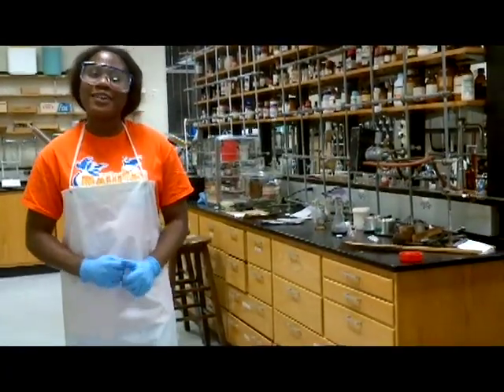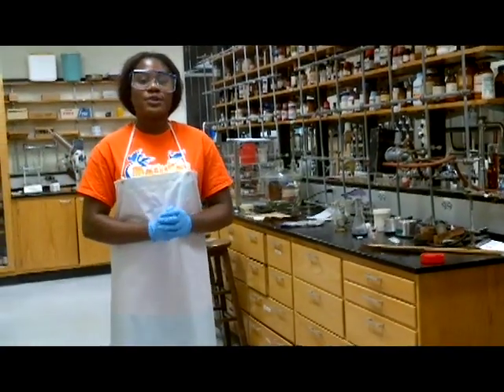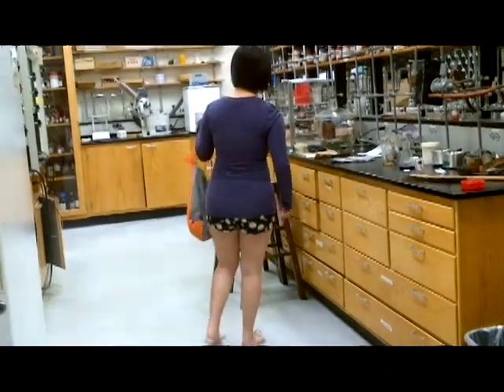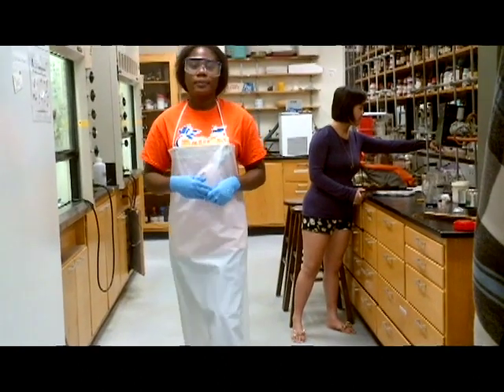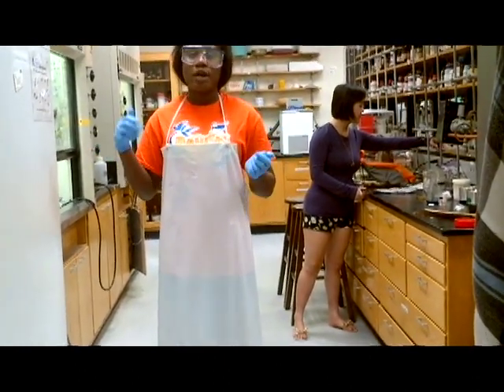So this is part 1 of the lab safety for organic chemistry, and this is going to be on lab attire. For this part, I'm going to ask you guys to spot what you think was wrong with her attire.